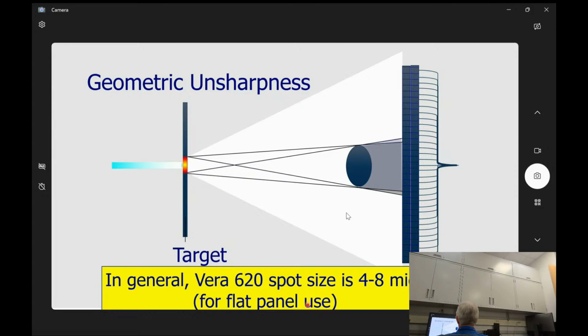For other applications, for the other objectives, go with the tables. But from what Zeiss tells me, if I go to, say, the 40x objective, and I'm trying to get to the limit of what it can do, which is about 300 nanometer voxel size, then I may want to use not the full power that the kV setting can be set to, but maybe a third of it, 2/3 of it.